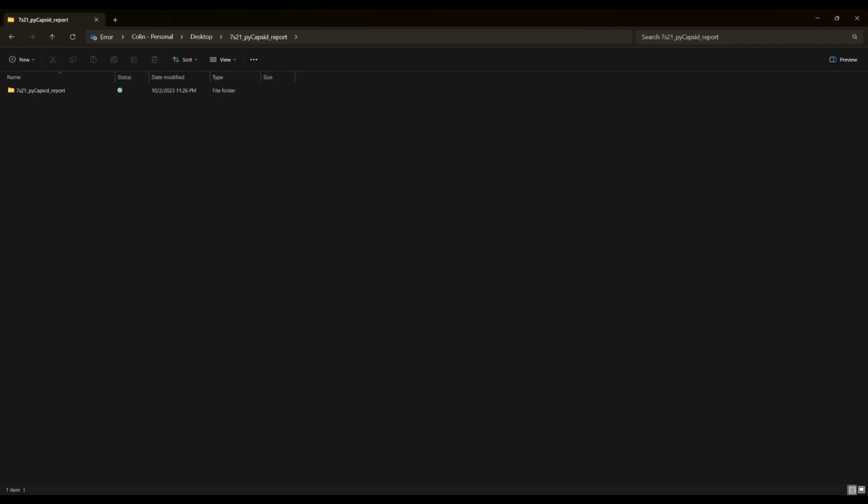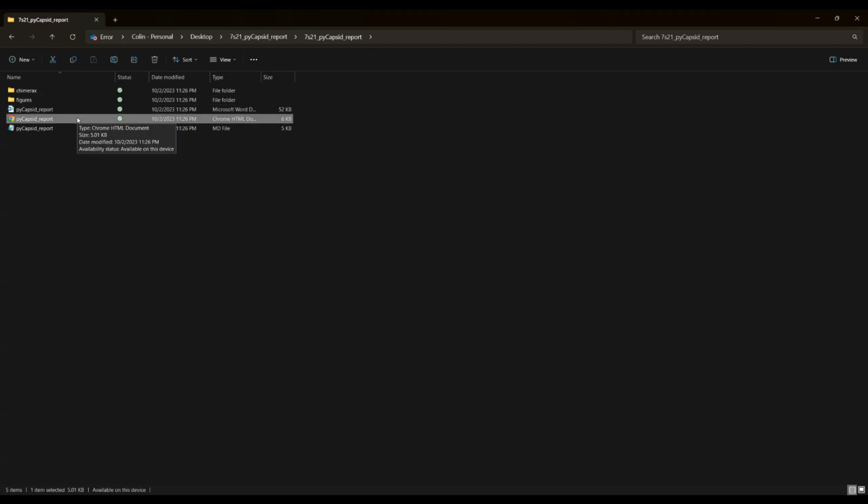One of the key outputs of pyCapsid is its summary report, and in this video, I will briefly describe how to interpret each section of the report. I'll be using the HTML version of the pyCapsid report as an example because it can be easily visualized in any browser.